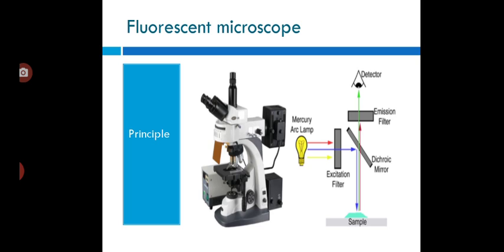Since most of the excitation light is transmitted through the specimen, only reflected excitatory light reaches the objective together with the emitted light. Microorganisms in a specimen can be stained with a fluorescent dye. On exposure to excitation light, organisms are visually detected by the emission of fluorescent light by the dye with which they have been stained. Bacteria stained with fluorescent dye become visible as brightly glowing objects in a dark background.